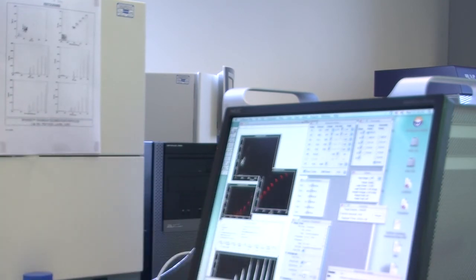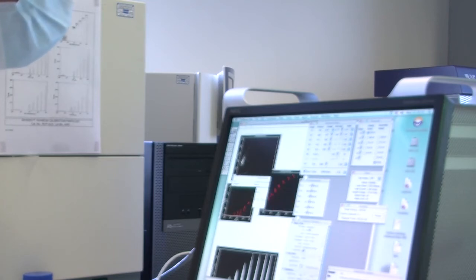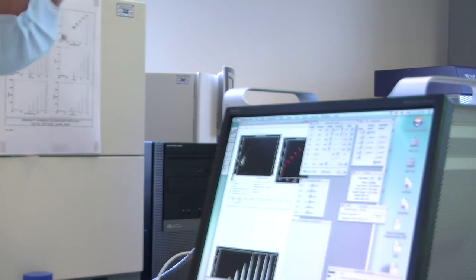Now, at the moment, we won't get it. I'm just going to stop that, simply because I'm most of the way through that tube now. Let's put that up there. Trying to find enough room, that's why analysing it later is often easier. Right, let's just get rid of that one. Too many windows open, that's the problem.